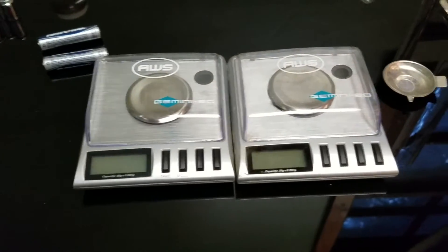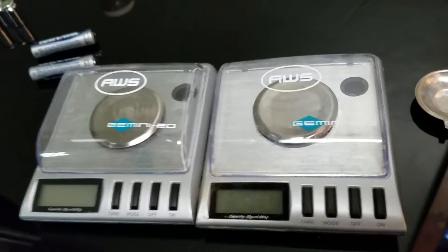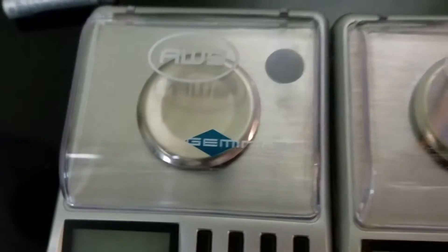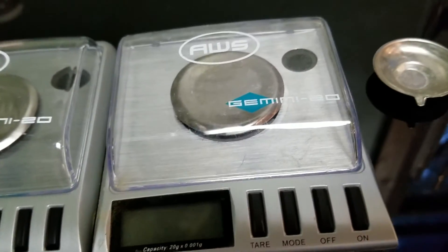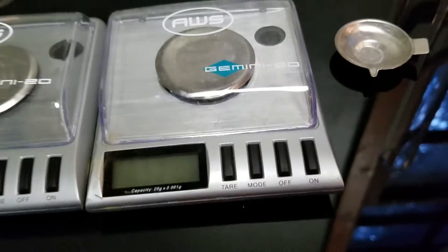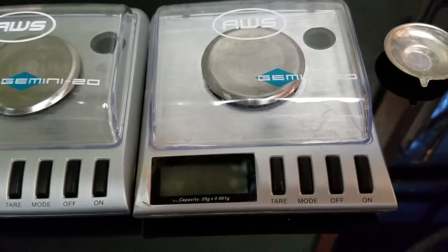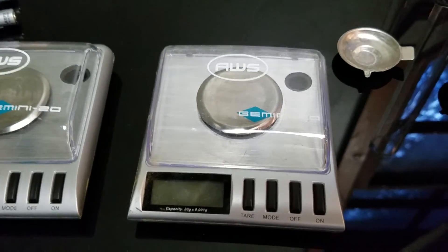This video is to demonstrate why you should just spend the extra $60-$70 on a milligram scale that's laboratory certified, and completely avoid these AWS Gemini 20s when you're weighing something that needs to be accurate up to the milligram or even 5 milligrams. These just won't cut it. They're good for pretty much anything around the 50 milligram plus or minus disparity, but other than that, I would not trust them with anything.